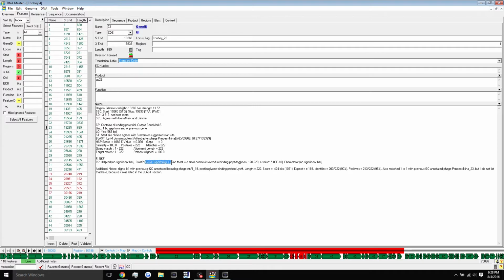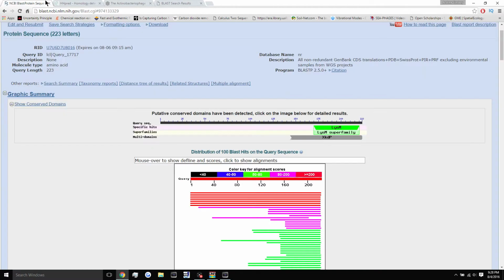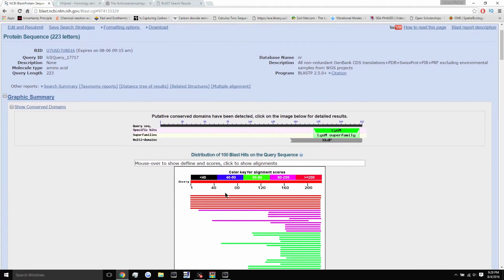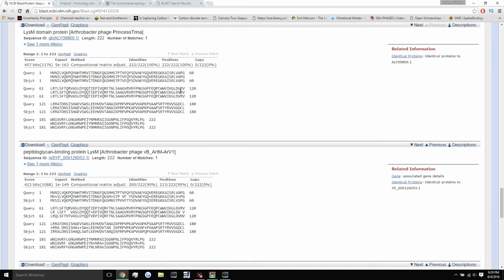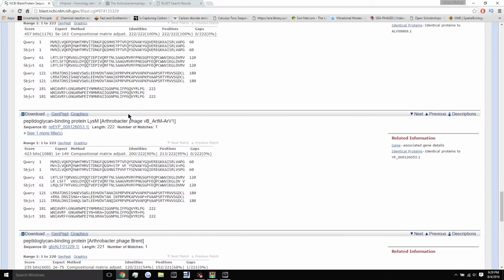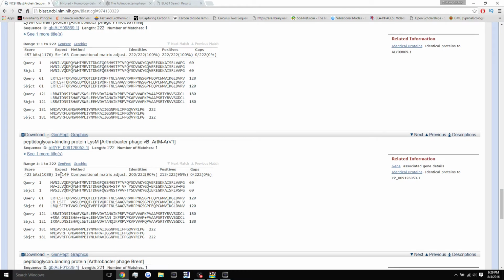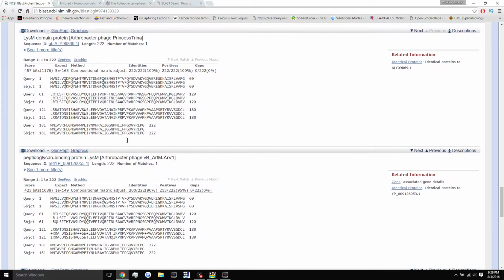So that's definitely good that we found a conserved domain, and we noted that here, and the QC process will see that. Now if there was no conserved domain that we found, this box up here wouldn't show, and you'll just see results. And when that happens, all you do is click the top result. It'll take you down here, and you're going to go through the first couple of results to see if they not only agree in function, but if they are good results, again comparing the E value, the alignment, and the species. And as you'll see here, these are all pretty darn good results.